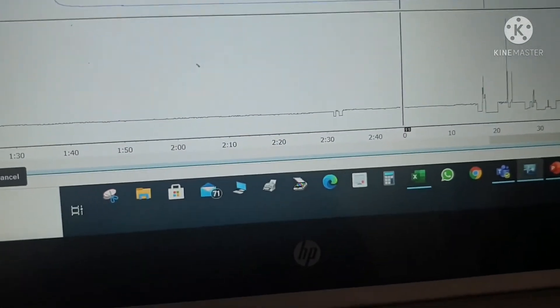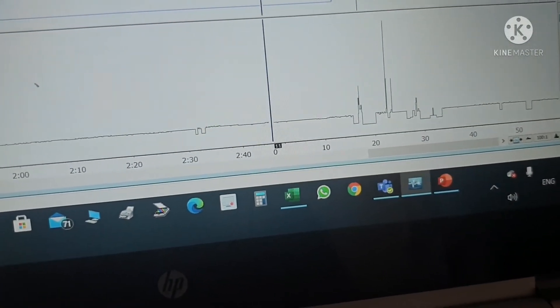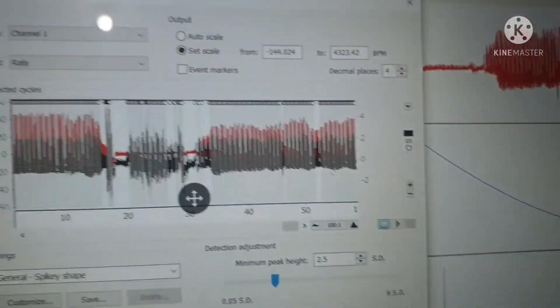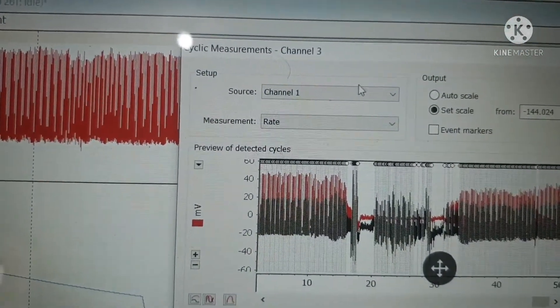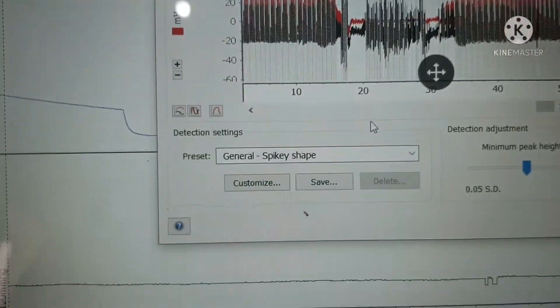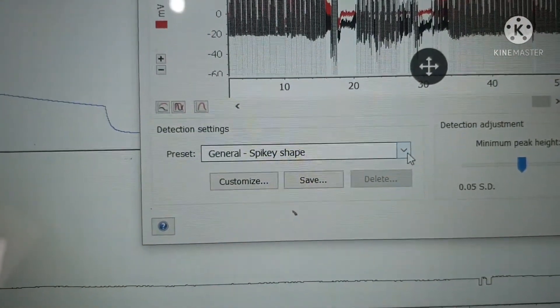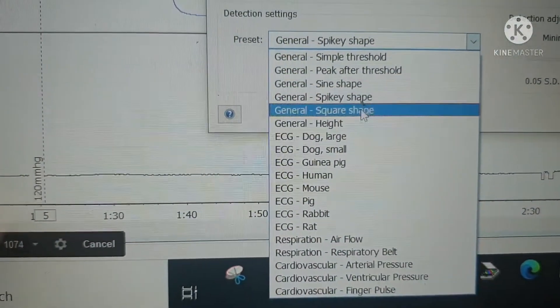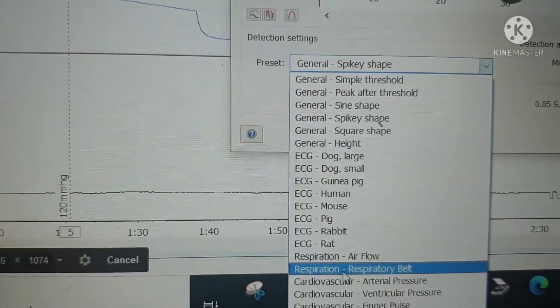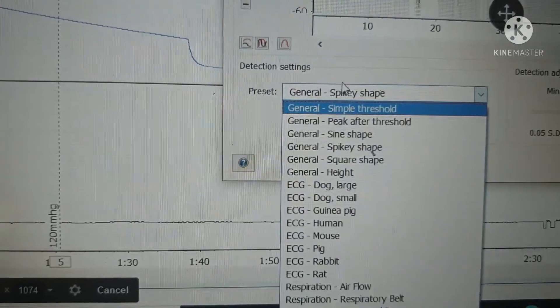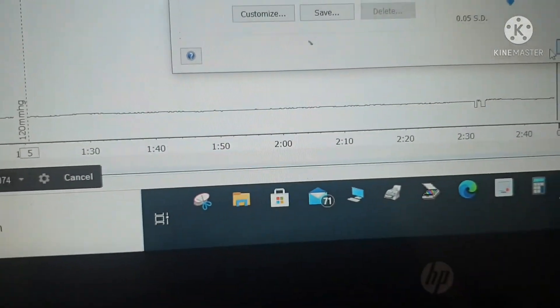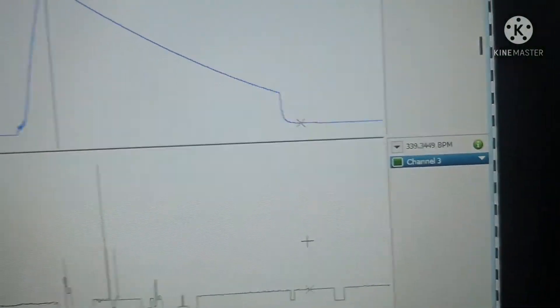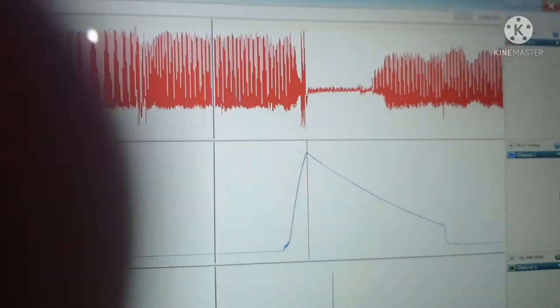In channel 3, we have already set it and it gives you the heart rate, which is 335.4 beats per minute. To set channel 3, go to cyclic measurement. The input is from channel 1 which is the pulse. Then select general spiky shape — for beats per minute you must select the general spiky shape — and the value will then appear as beats per minute. This is how you calibrate the file.